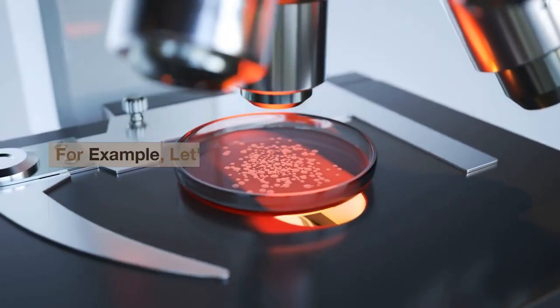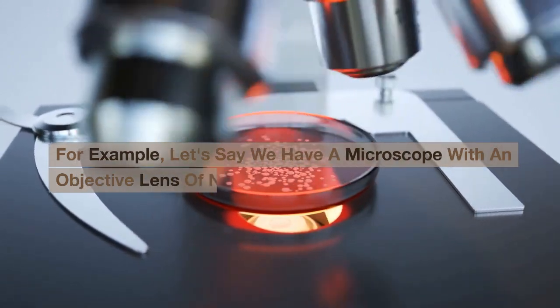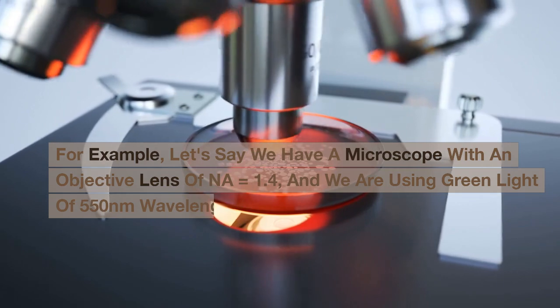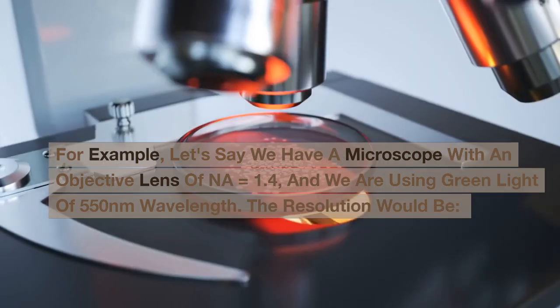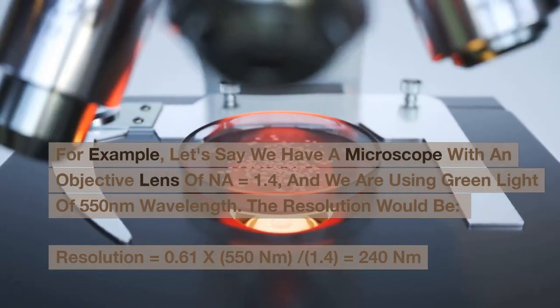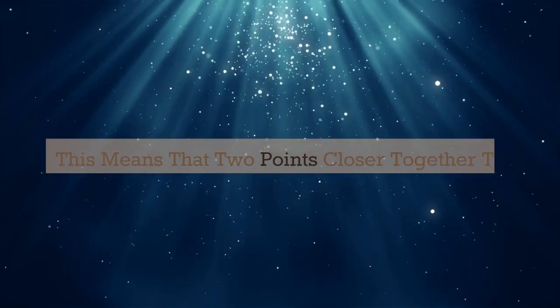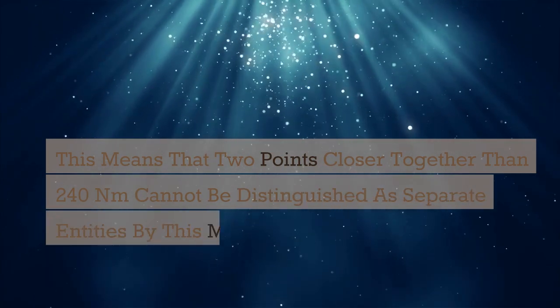For example, let's say we have a microscope with an objective lens of NA equals 1.4, and we are using green light of 550 nanometers wavelength. The resolution would be resolution equals 0.61 times 550 nanometers divided by 1.4, which equals about 240 nanometers. This means that 2 points closer together than 240 nanometers cannot be distinguished as separate entities by this microscope.